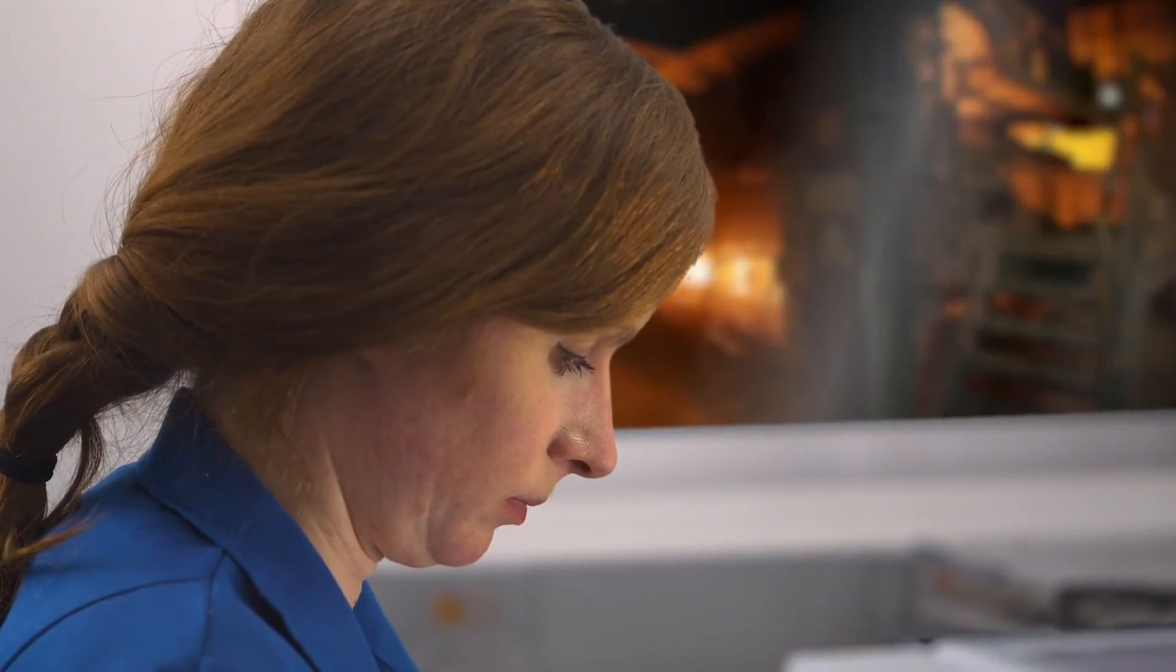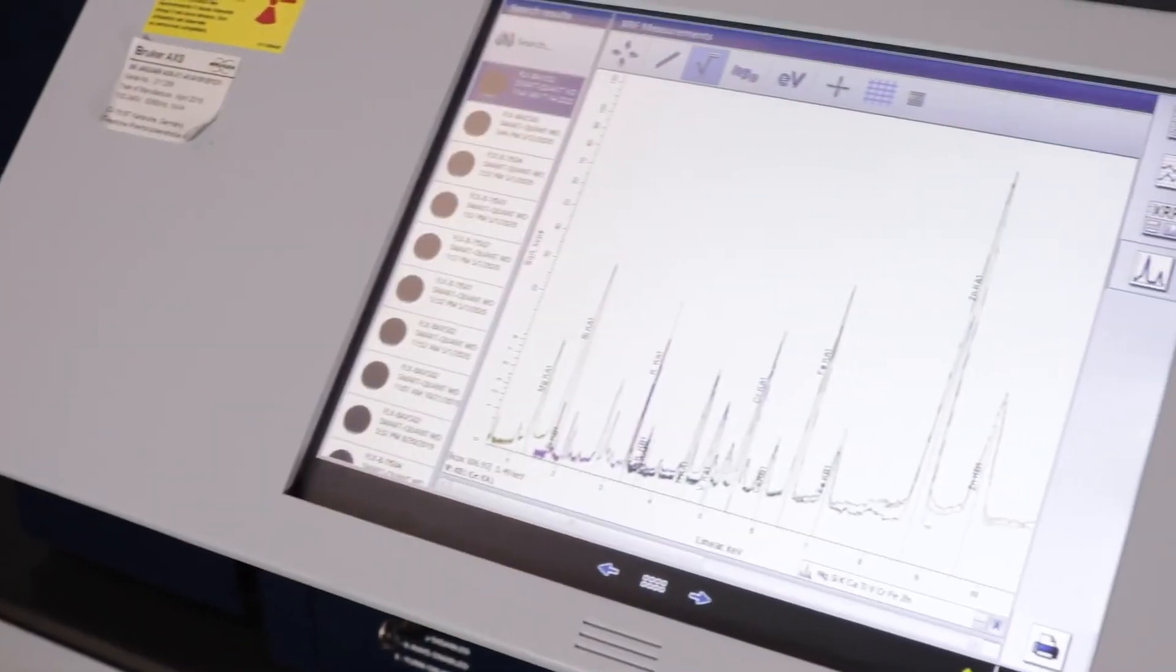Just remember, when sample throughput, analytical precision, and trace element detection matter, the S6 benchtop WD XRF delivers.